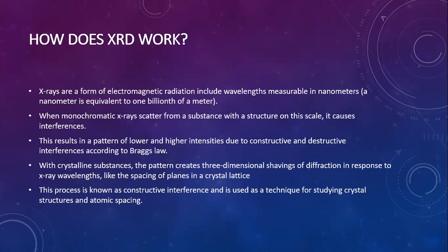This results in a pattern of lower and higher intensity due to constructive and destructive interference according to Bragg's law.